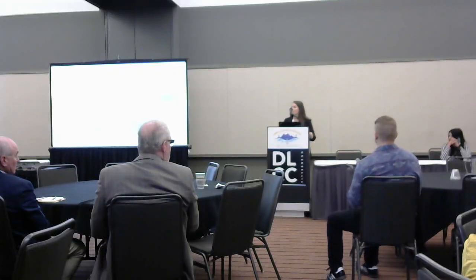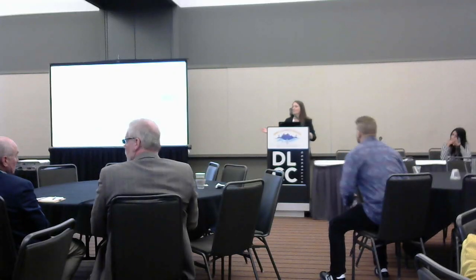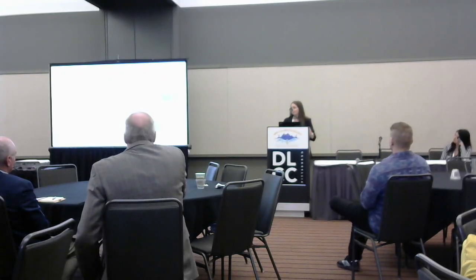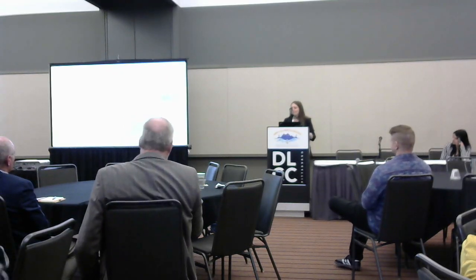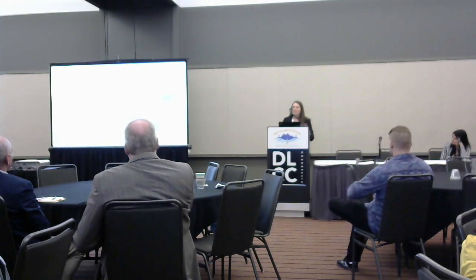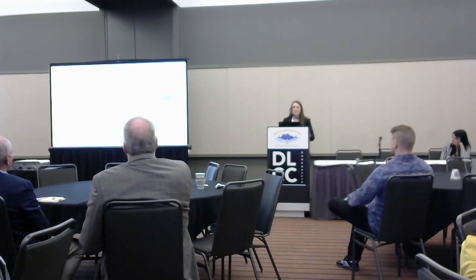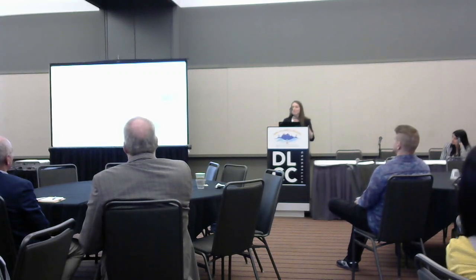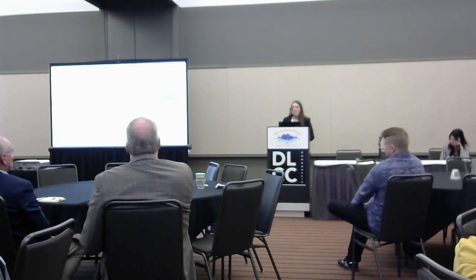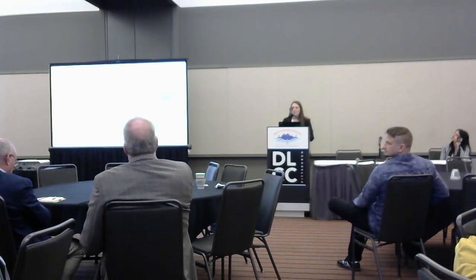questions. A lot of people come in and think that this linear process is what they're going to be experiencing when they start the image analysis process. That is not at all true. At any point in the process, you need to loop back to any earlier part in the process. So your sample preparation, you may actually be adjusting that all the way through to the point of determining your analysis approach. Same thing with the microscopy settings.